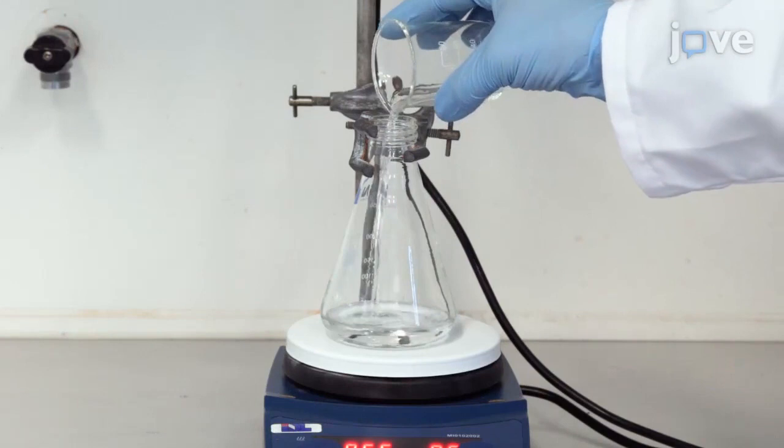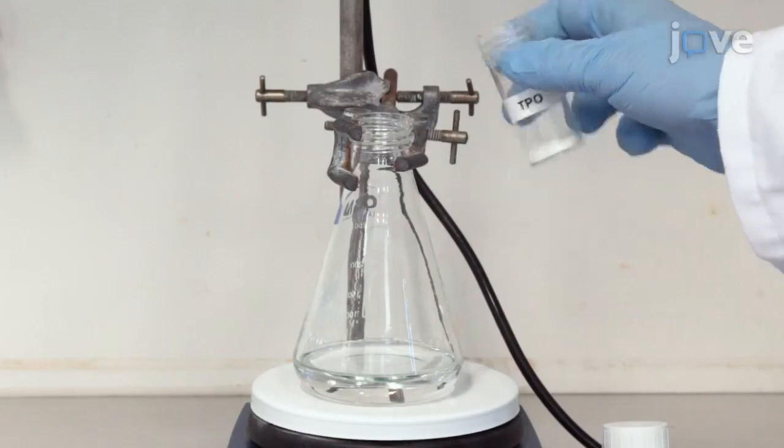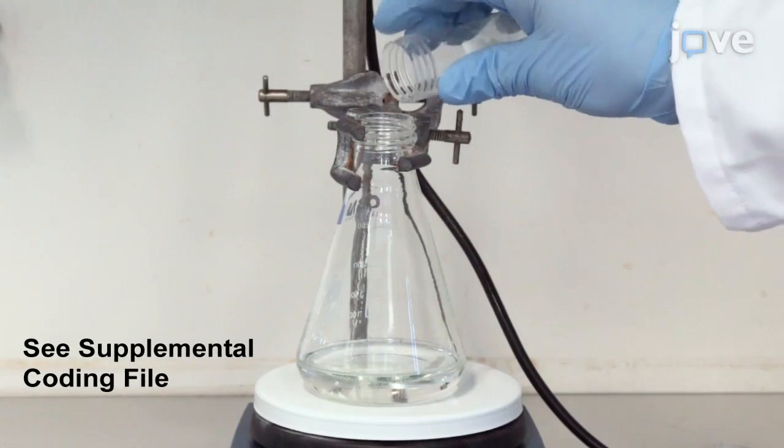To begin, pour 50 grams of 1,10-decane diol diacrylate in a 500 milliliter Erlenmeyer flask. Add 1.0 grams of TPO and 0.40 grams of BBOT to the flask.